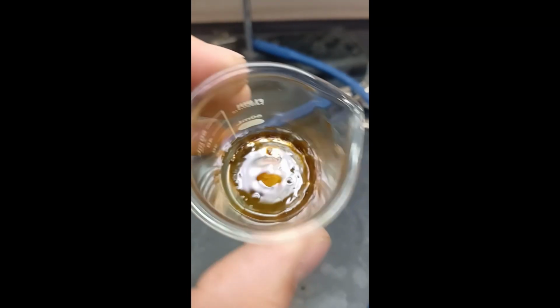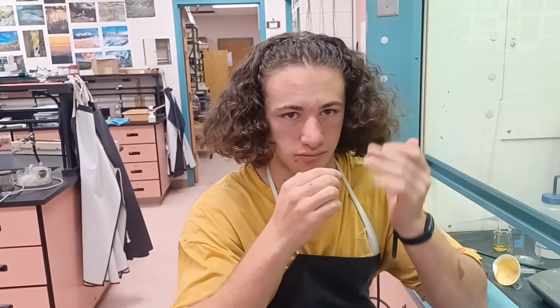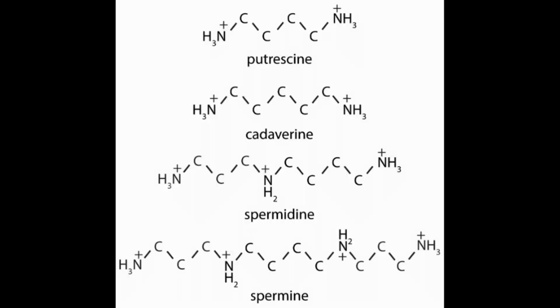A yield of 63% was calculated, which was quite good for this relatively unsophisticated method of synthesizing cadaverine. Unfortunately, the odor was not anywhere near as powerful as expected. This reaction was conducted with very small amounts of lysine, meaning only really small amounts of cadaverine could have been formed. Organic chemistry is kind of mean, and likely a lot of what was produced was not actually cadaverine.